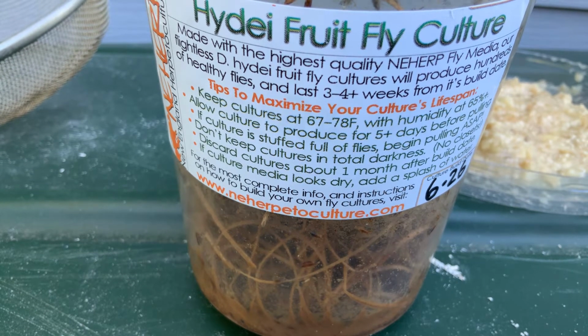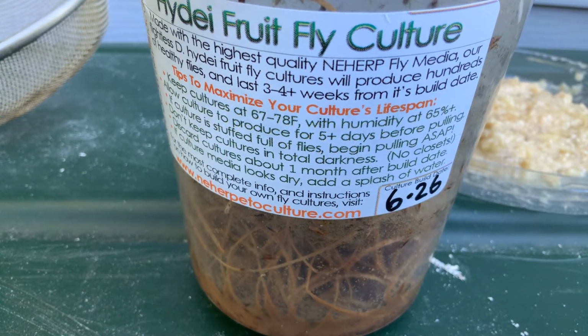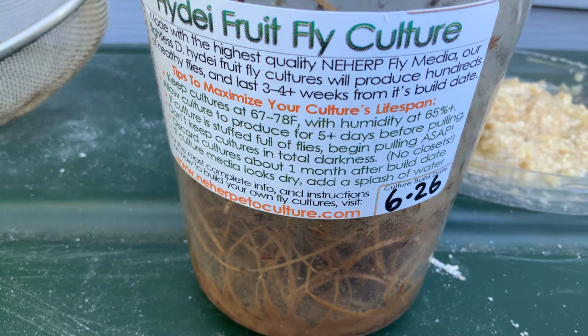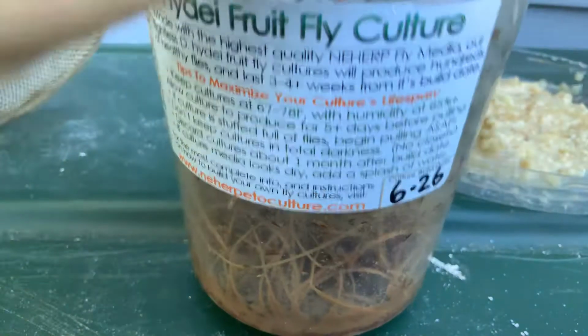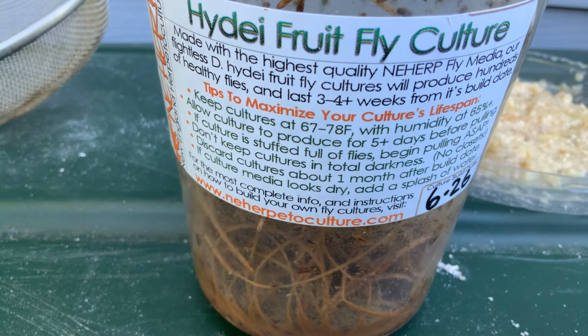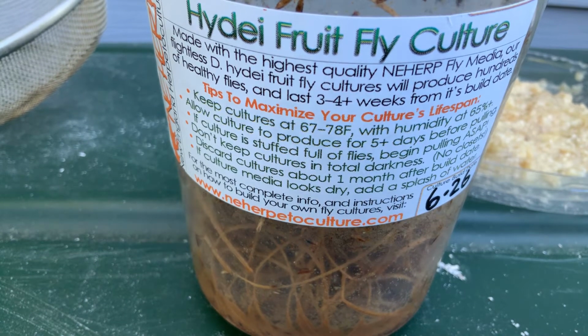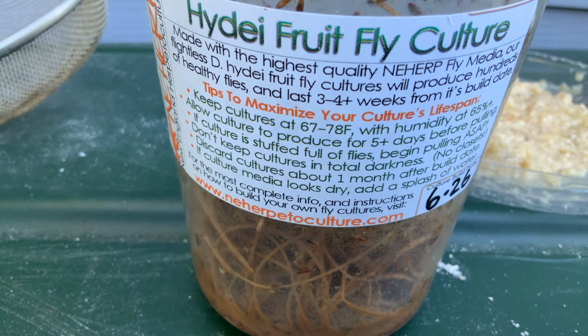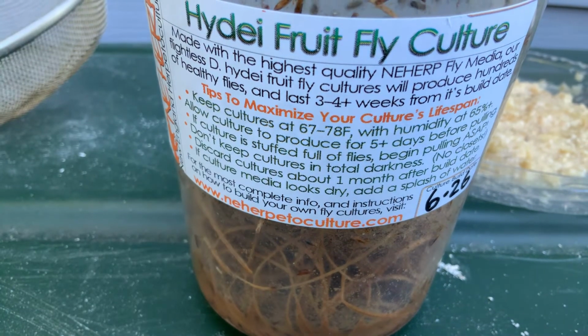It'll last about a month from its building date, but it won't have flies right away from its building date though. So this was built on the 26th, and so it has about 10 days left of its life, maybe a week. And you shouldn't keep them in total darkness, and you should get rid of it after 1 month of the build date, and if the food looks really dry, add a splash of water. That's really it, and so now my mom brought all the stuff, so yay!